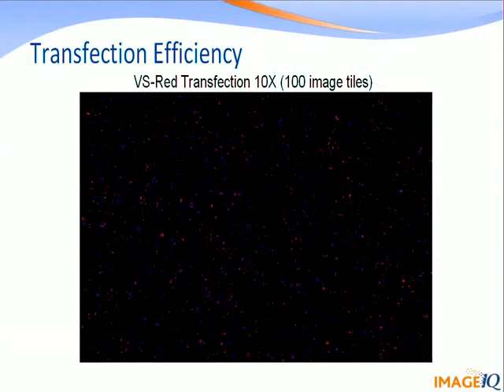Traditionally, to assess whether your population of cells on a cell culture surface area is positive for a particular protein or stain, a technologist will review a slide on a microscope, randomly taking images across the culture surface area or looking through the oculars and then counting with a cell counter. This can create a number of errors. It can be imprecise, it has issues with accuracy, and then it can underrepresent your sample depending on the number of images or fields that you analyze.